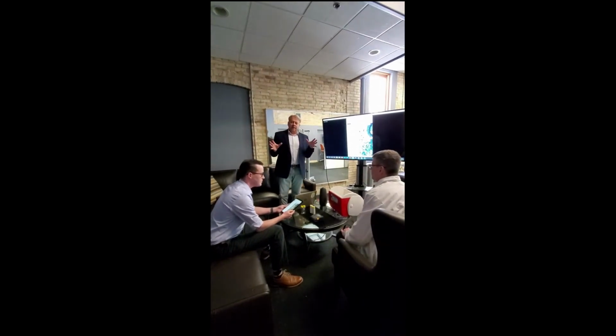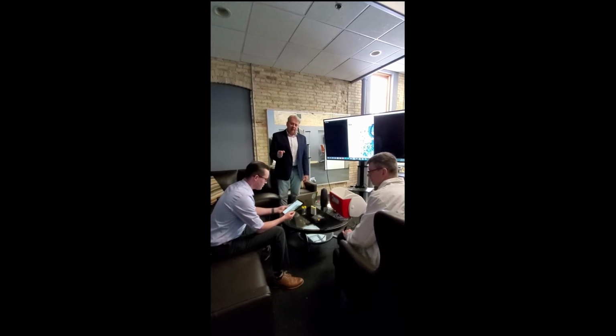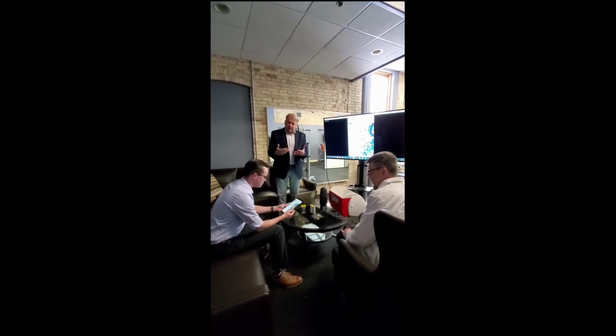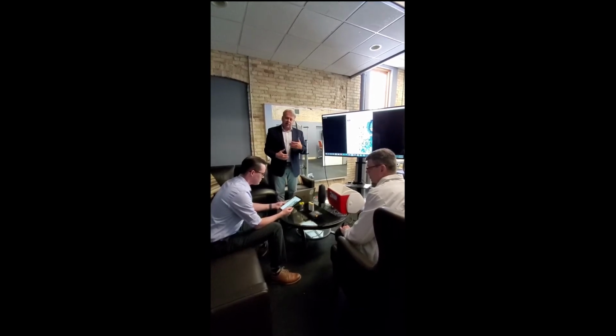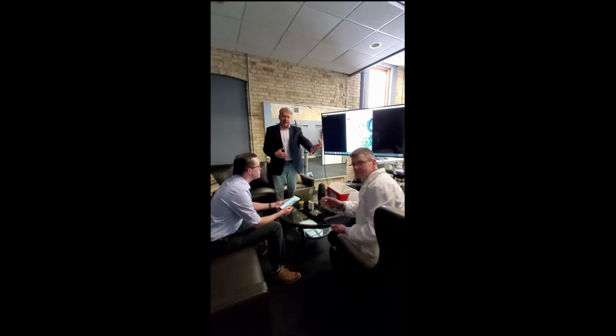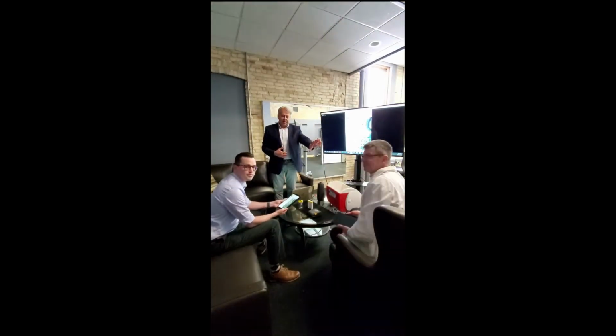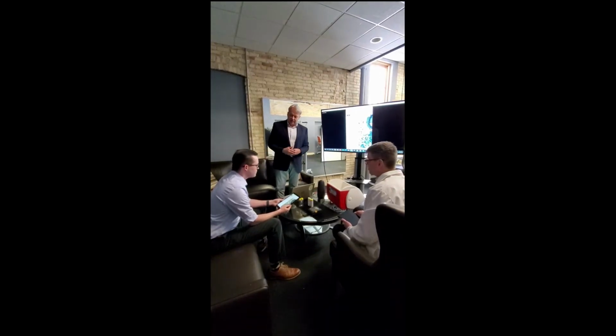What we're going to do here today is demonstrate the Field App. Jake here is our product manager. He's going to act like he's collecting a sample in the field, and then he's going to finish the project, put everything in a cooler, pretend like he's shipping it out using the digital chain of custody to the laboratory, and then Asher is going to act like a laboratory and accept the samples with the laboratory app and then log them in using the app and the digital chain of custody. So Jake, go ahead and take it from here.